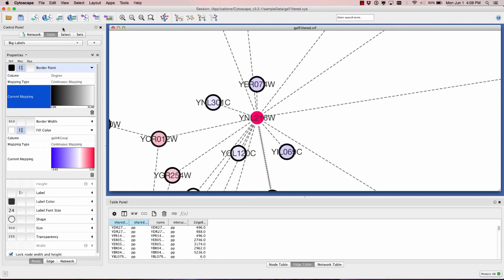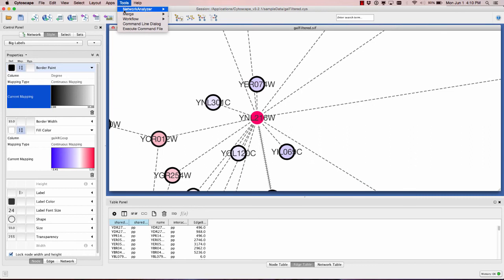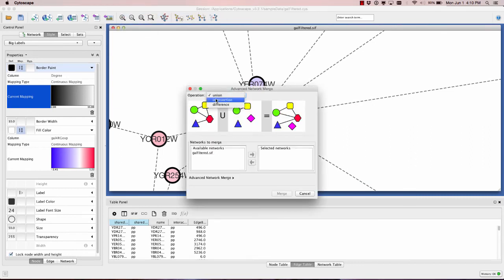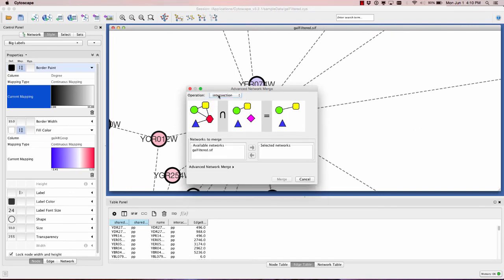Cytoscape starts off with network information. You can convert a gene list to a network - we'll learn about that tomorrow with Genemania. If you have protein interaction information from different studies, you could load them both up. One of the tools here is the merge network function, where you can take a union, intersection, or difference of different networks - that could tell you what's different between studies.